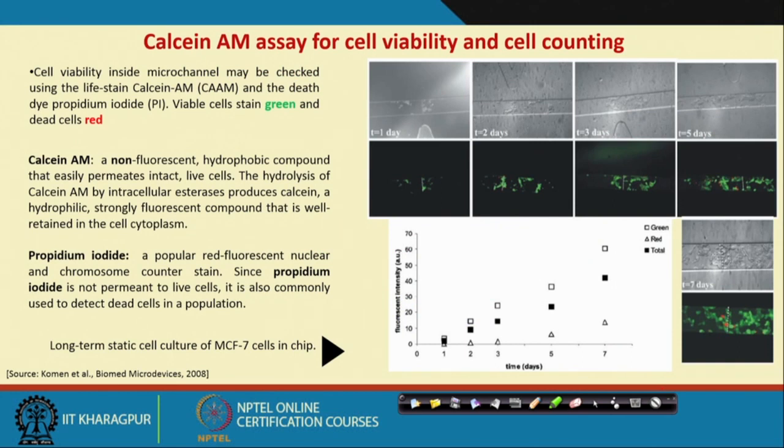Cell-based assay system means cell growth. It is a very preliminary experiment in the microfluidic platform. Here, we want to measure cellular growth over time and how many cells are viable and how many cells are dead.